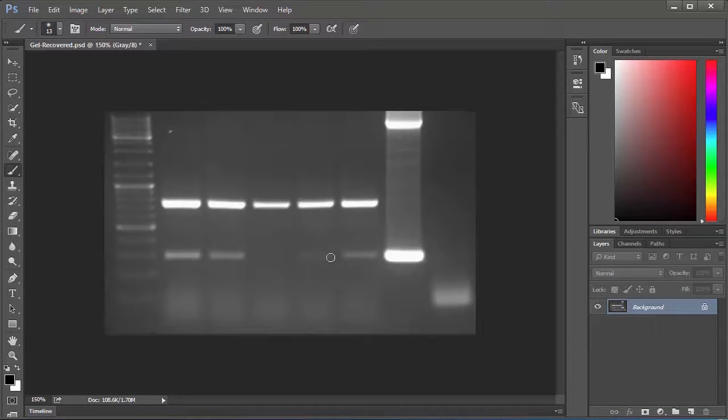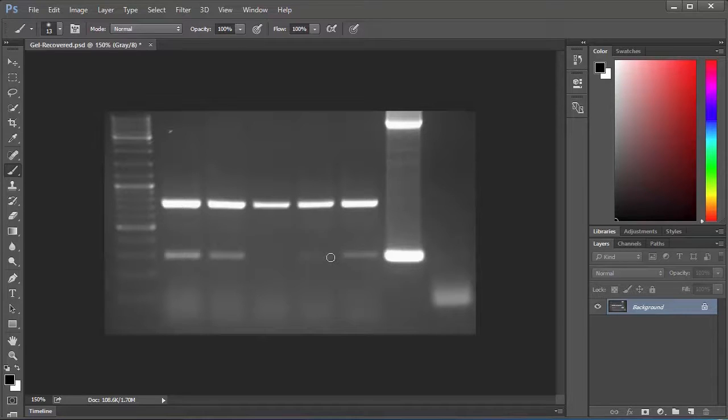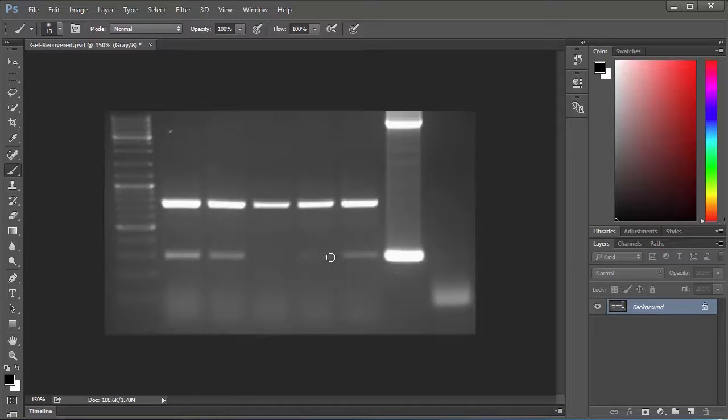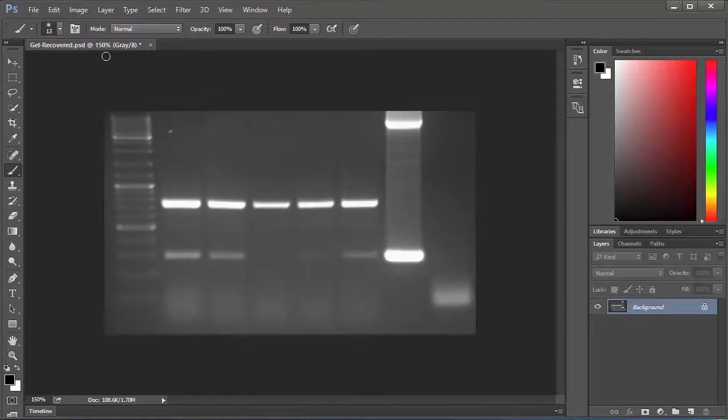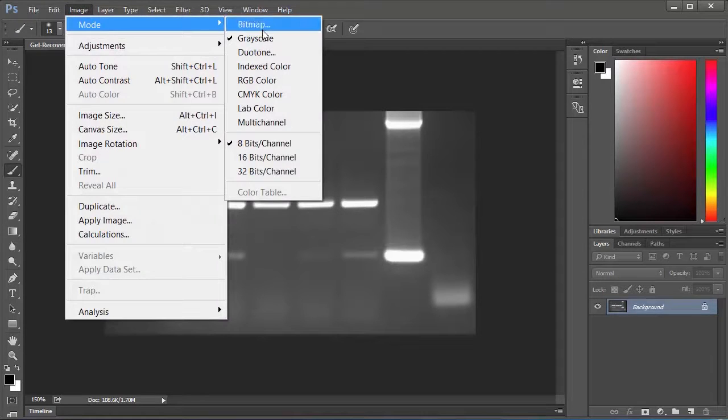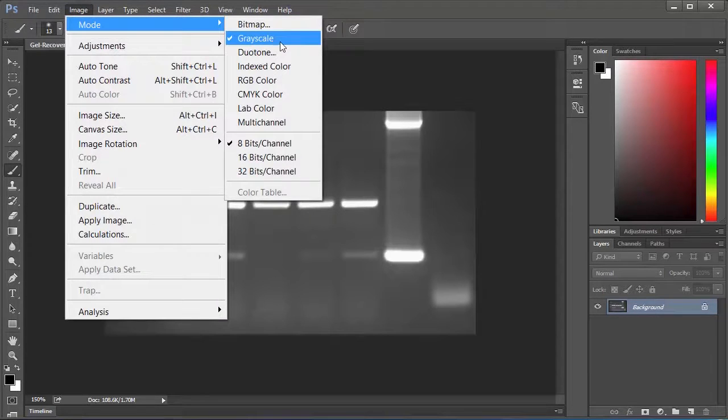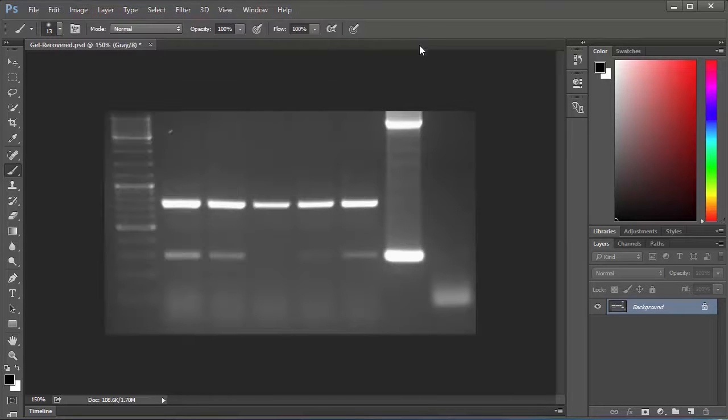A lot of the time this functionality may be present in some lab software that you have, like if you have a gel doc or something like that. But if you just have an image or a scan document or a photo, or if you just want to do it in Photoshop, I'm going to show you exactly how it can be done. So let's get right to it. The first thing you want to do is make sure that your image is in grayscale. To do that you go up to Image, Mode, and select Grayscale, which mine already is.